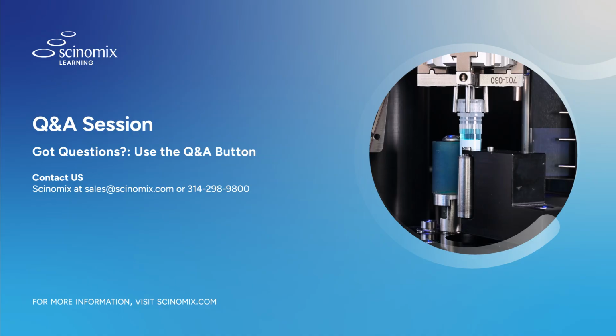Good. This one might be about the same as the last question. Taylor's asking, how do you ensure that sterility is maintained? Yeah, absolutely. We have HEPA filtration if you want to do it benchtop, where we're putting positive pressure through the system and 99.9% of all air particulates are going to be filtered out. Or if you really need your lab safety procedure and sterility procedure, putting it in a biosafety cabinet would be your best bet. Again, wiping it down with isopropyl where you can, or using the UV light that's in your biosafety cabinet with the lid off of the device could also work to ensure your sterility needs are met.